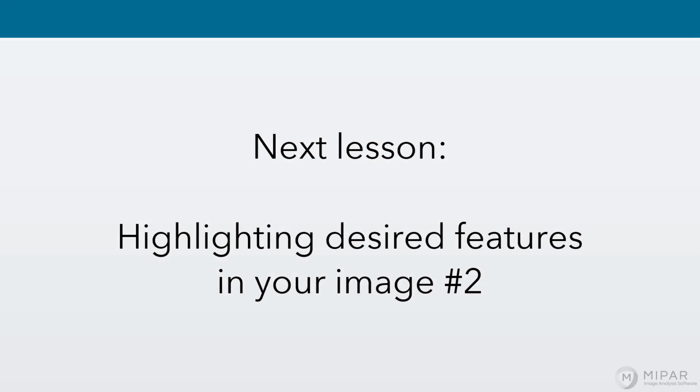And that's been our lesson on highlighting desired features in your image. Next week we'll still be on this same topic, but we'll talk about combining two different filters that each have their own side effects, and how you can use different filters to compensate for each other.